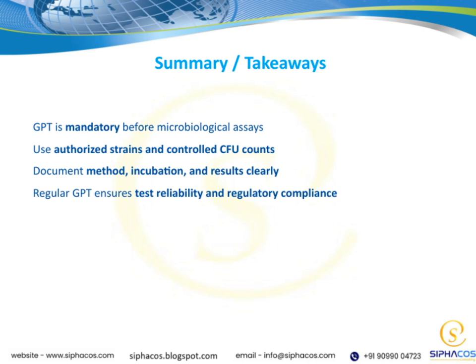Next, documenting the method, incubation conditions, and results clearly is vital. Clear documentation not only supports reproducibility, but also helps us stay compliant with regulatory requirements. Finally, implementing regular GPT checks is essential because it maintains test reliability over time and keeps us aligned with regulatory standards. Overall, these points underscore the importance of a structured, well-documented approach to microbiological testing, ensuring both accuracy and compliance in our work.